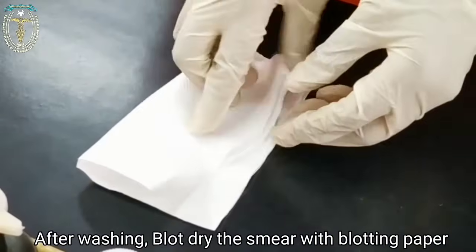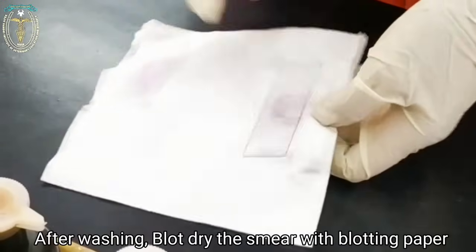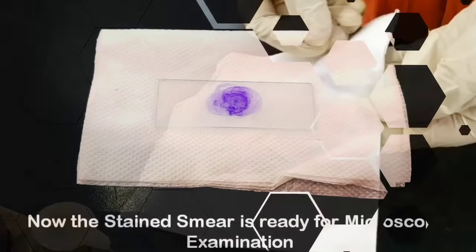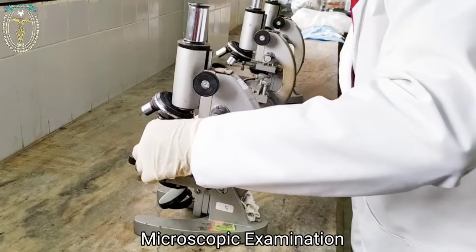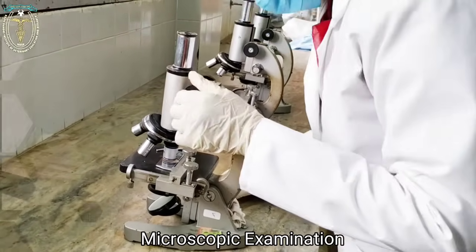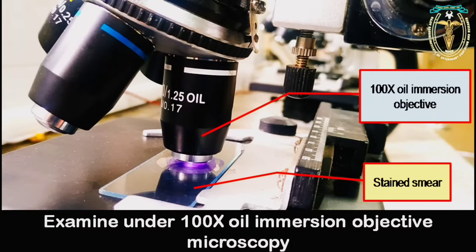After washing, blot dry the smear using the blotting paper. Now, the stained smear is ready for the microscopic examination. Place the stained slide over the stage. Examine the slide under 100x oil immersion objective microscopy.